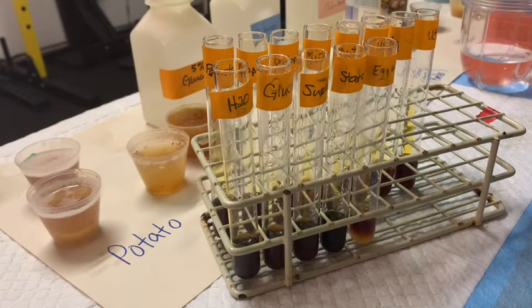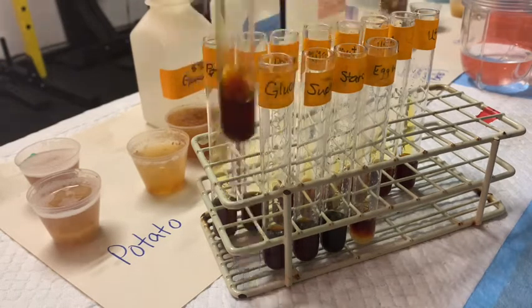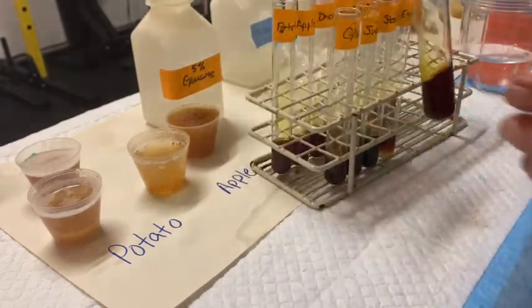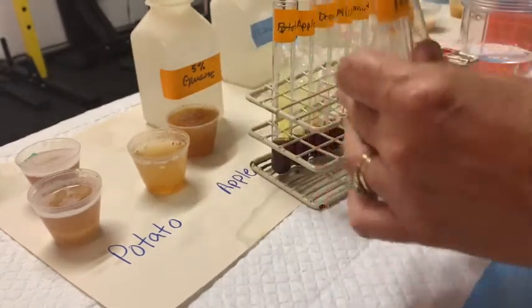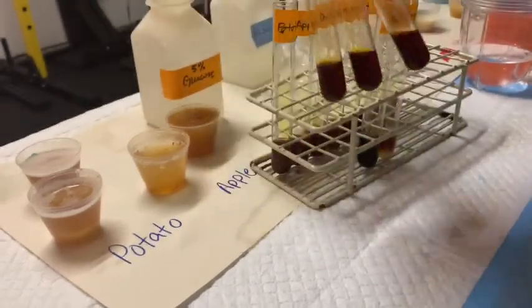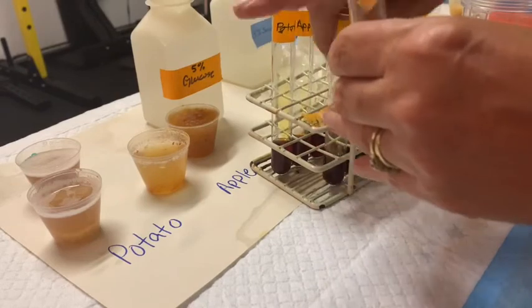Our negative is going to be our water, and again it has kind of a dark brown color. Let's compare that now with glucose and sucrose — I don't anticipate that those are going to look that much different, and they really don't. They look pretty close to the negative control.